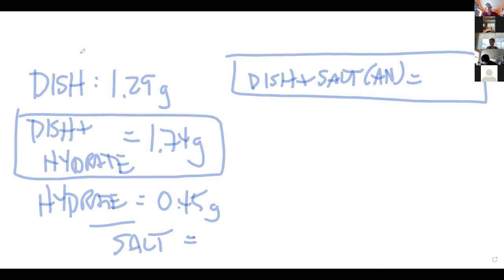So this is cooled off. Yeah, it'll cool off pretty quickly because we are dealing with a metal. Not only do metals conduct electricity really well, they conduct heat really well. So they gain heat really fast and they lose heat really fast.